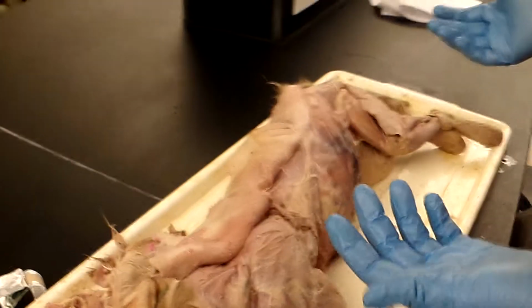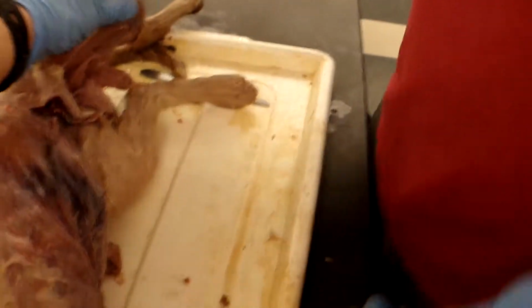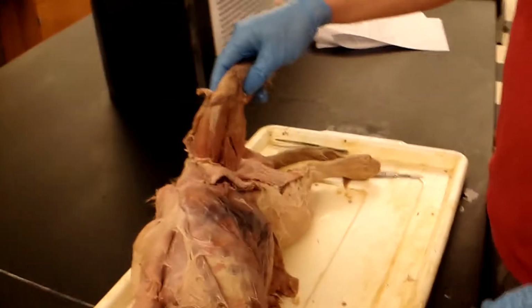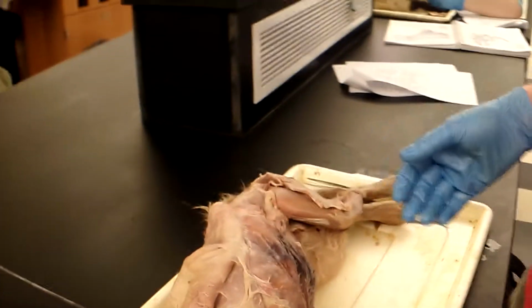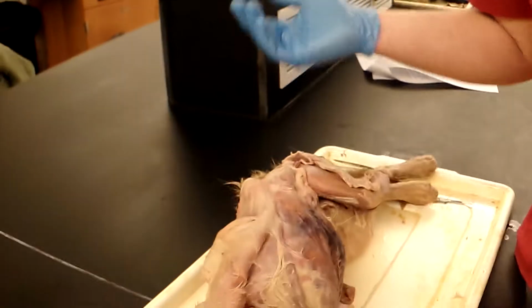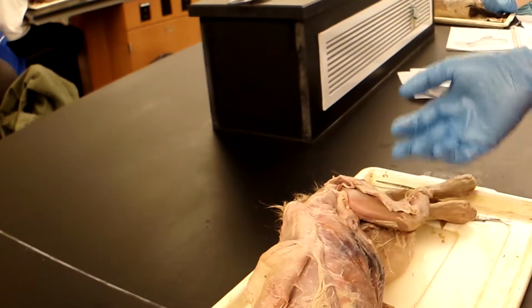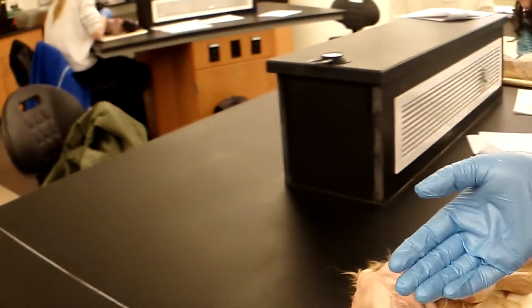The origin is the ilium. The insertion is actually the one underneath here. We peeled it back, we cut it open, remember? So the origin is the ilium, the insertion is the tibia and the patella. The function is that it adducts and rotates the femur and extends the shank.